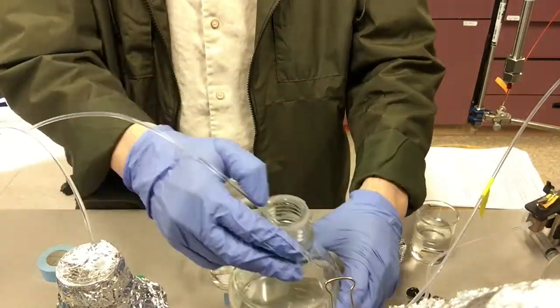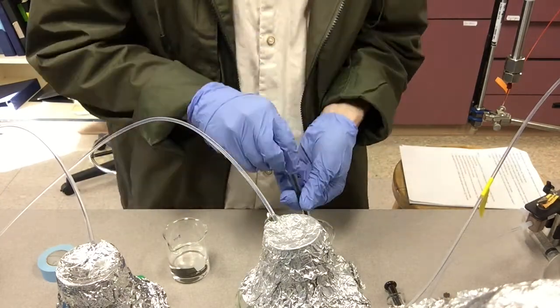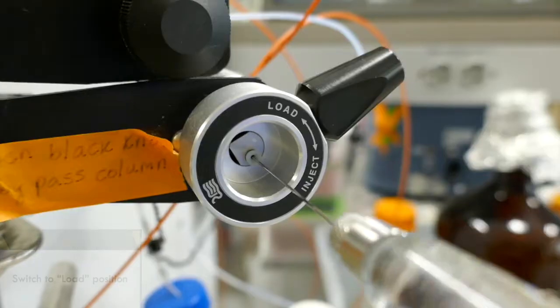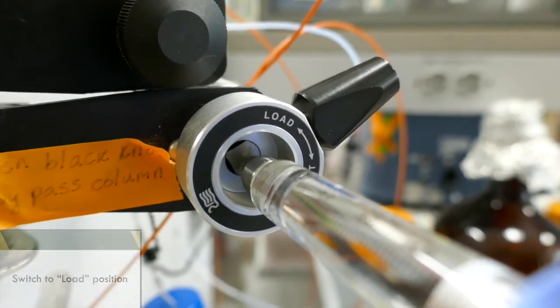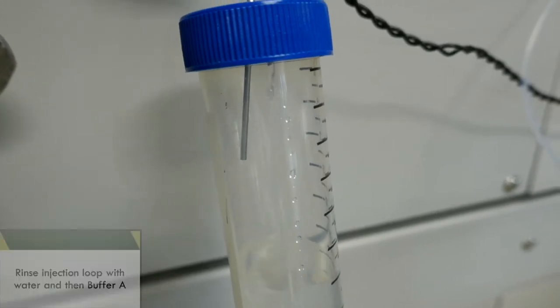Next, you're going to rinse the injection syringe with water and then with buffer A. With the injection loop in the load position, inject several loop volumes of A with a clean syringe.